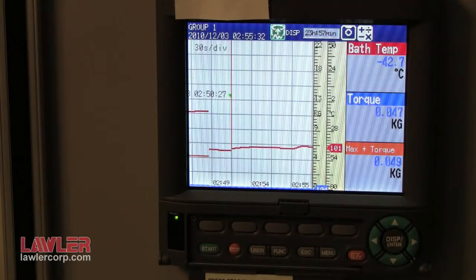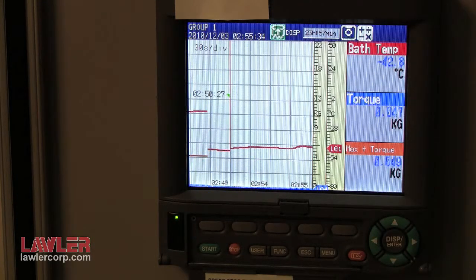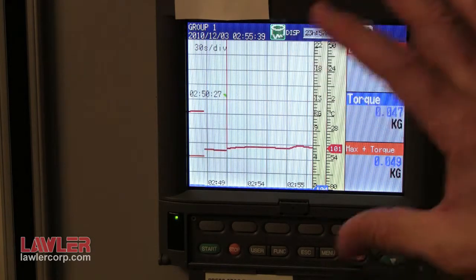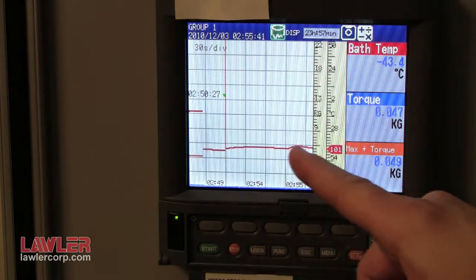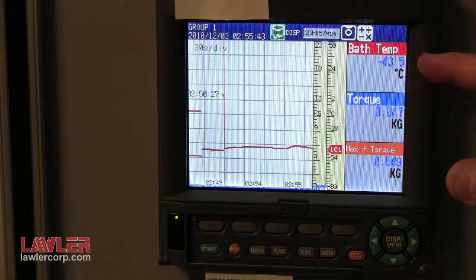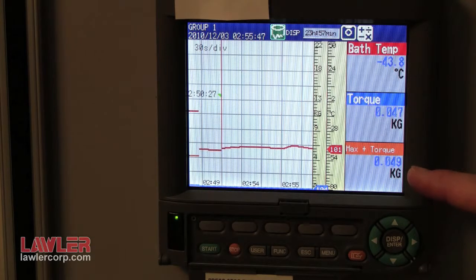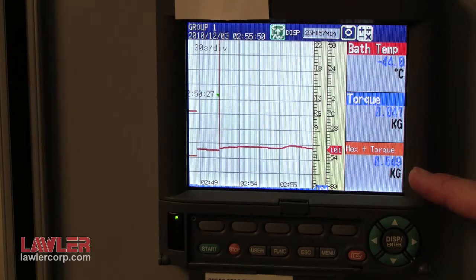With the motor running for one additional hour soak period, record the values. The recorder captures an XY plot as well as digital values of temperature, torque, and maximum torque, which is required in the method as the starting maximum torque.